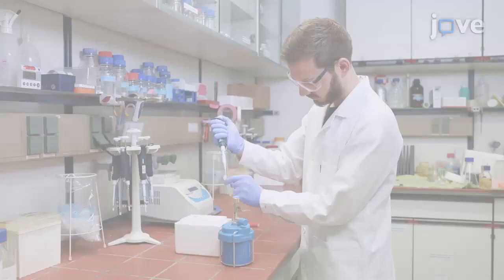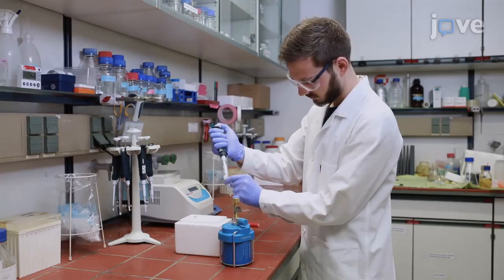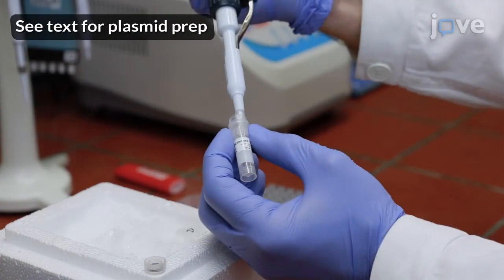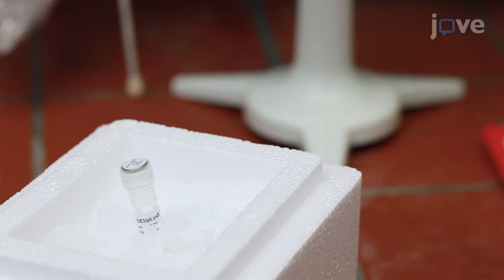First, insert 5-10 nanograms of plasmid into 100 microliters of competent BL21-DE3-P-Lys E. coli bacteria on ice. Slightly tap the tube to mix the contents. Keep the bacteria on ice for 30 minutes, gently tapping the tube every few minutes.